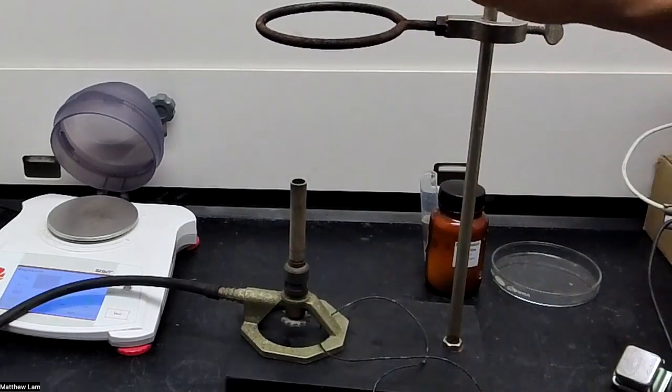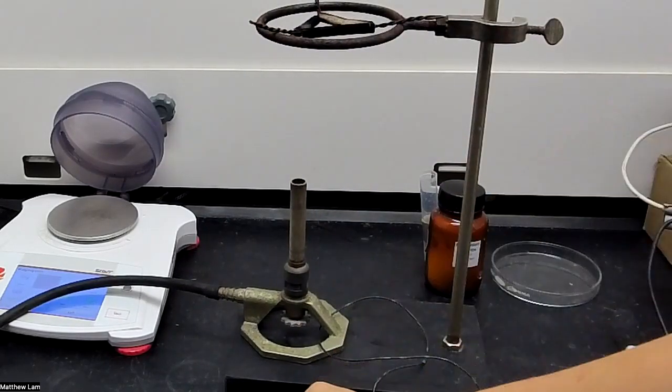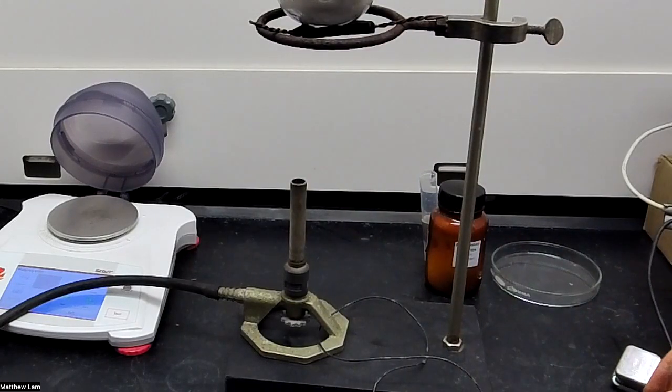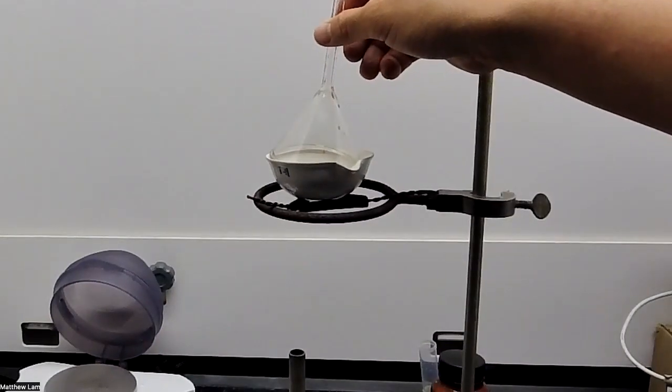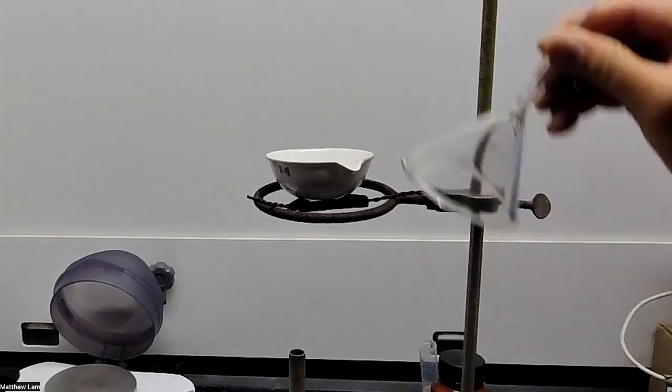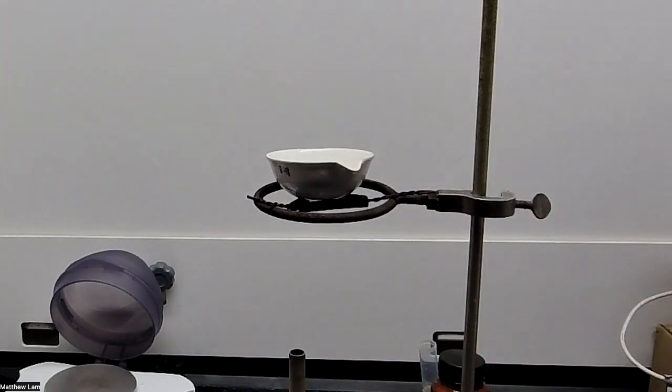We'll put our triangle wire, our evaporating dish. We'll have a funnel right on top of here to catch ammonium chloride when it sublimes. We're not going to put it out because it's going to fall and break. I will be adding a clamp to it to hold it in place.